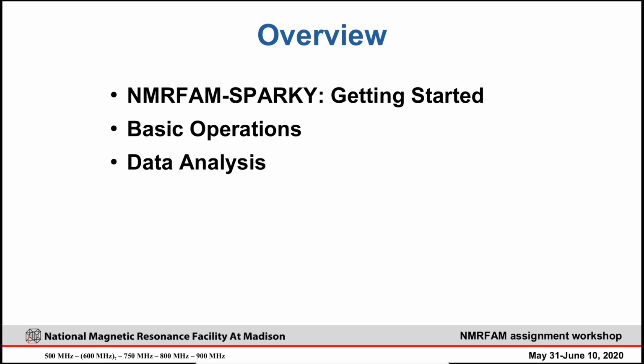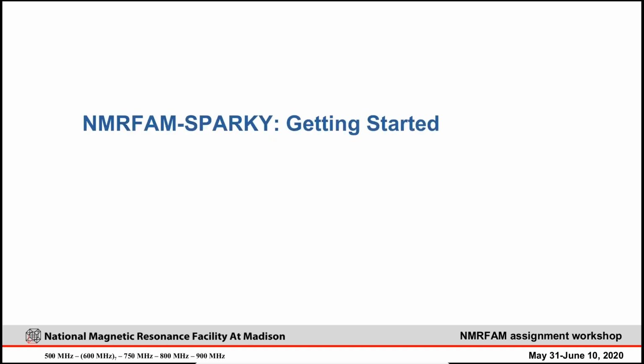We will go over how to start the Sparky software, basic operations, and very simple data analysis such as assignment. The backbone and sidechain assignment will follow this lecture. The most important part in this lecture is to get to know how to operate NMRFAM Sparky with the very basic visualization and controls, contour levels, and those sorts of things. So let's get started.